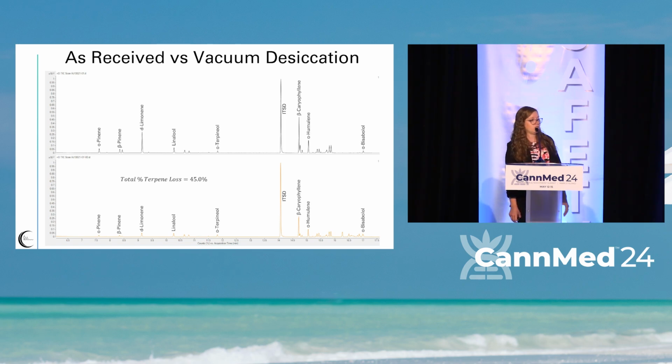However, one important thing to notice is that the terpenes in front of the internal standard drop off more than the terpenes behind the internal standard. And that's based on the heaviness of those terpenes and the volatility of those terpenes. So the higher the boiling point, the less they're boiling off in these methods, or the less they're coming off and volatilizing. In this one, this is at room temperature, so it's all just volatilizing based on that vacuum being utilized. Whereas those lighter ones, we are seeing quite a bit of degradation still.